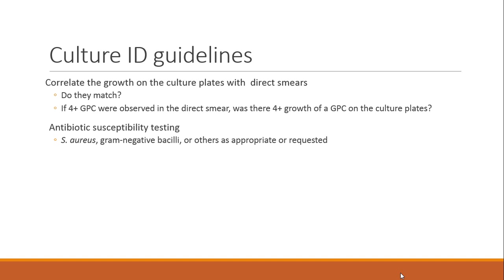The gram stain shows a gram-negative bacilli, and the growth on the plates shows a gram-positive bacilli. Ooh, you decolorized your stain too much, right?